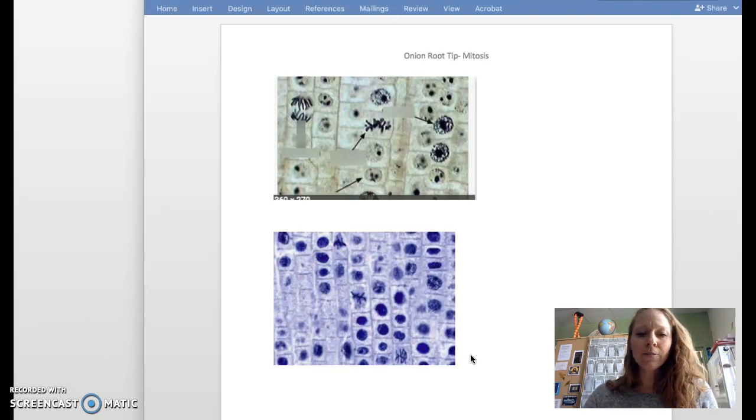And so during interphase, the chromosomes are in those loose, relaxed form called chromatin. And so that loose, relaxed form, it looks like this. These are going to look like your solid dots. They look like solid dots because if you think of like a ball of string, you can't see each individual string. You see just the whole ball, right? And so this is what you see right here is the ball of string.